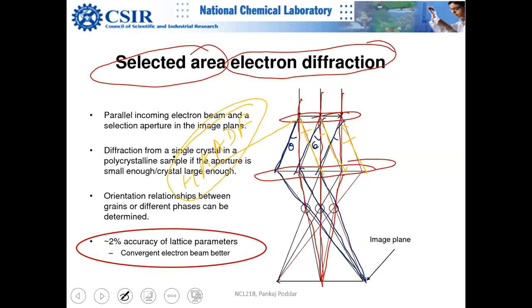Okay, we have already discussed. So electrons also scatter at high angles. Okay, electrons get scattered at higher angle, but they are not coherent electrons. That's why you can just look at Z contrast. They don't have phase contrast. Okay, I think you know that.